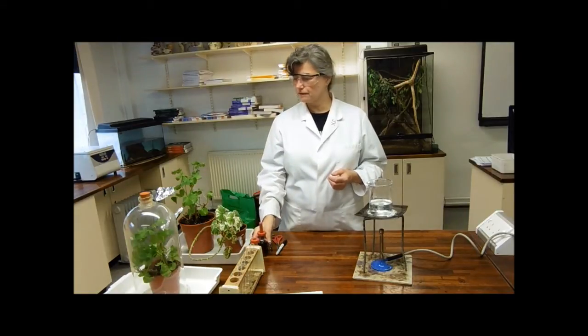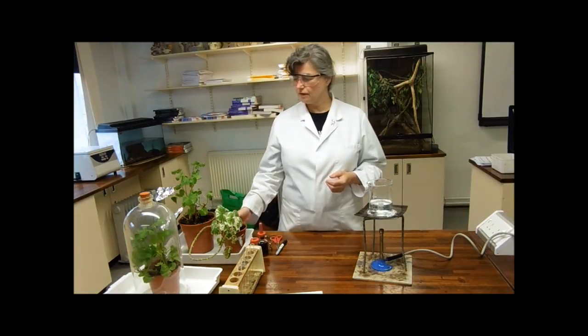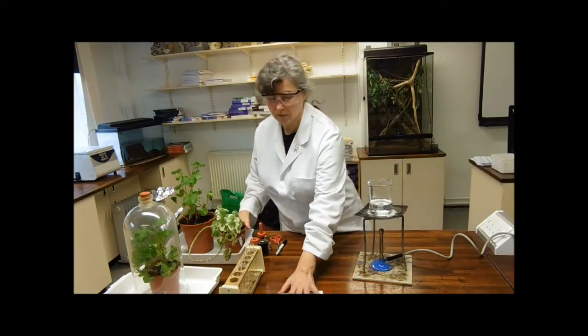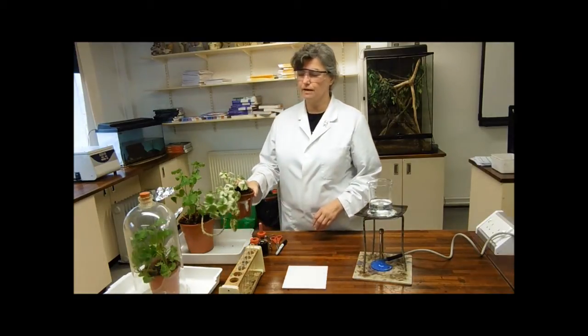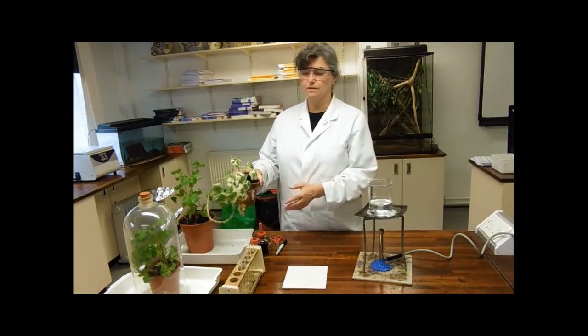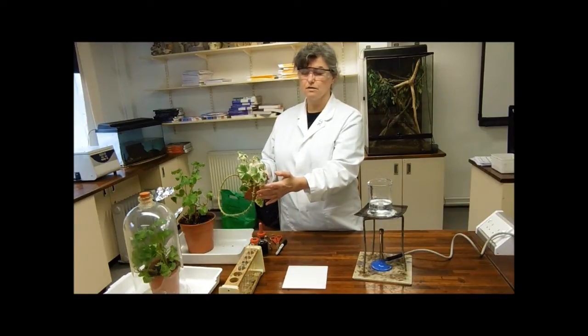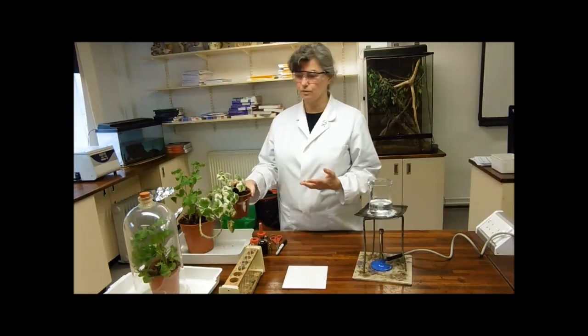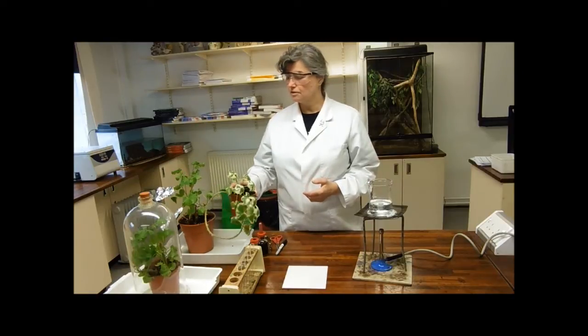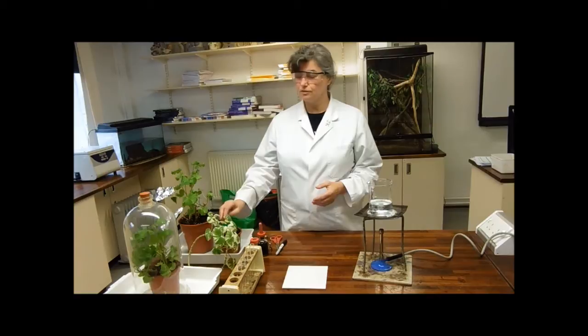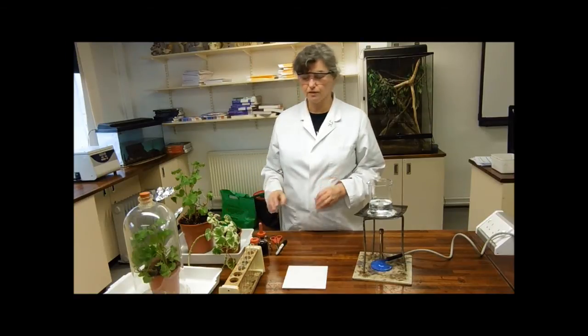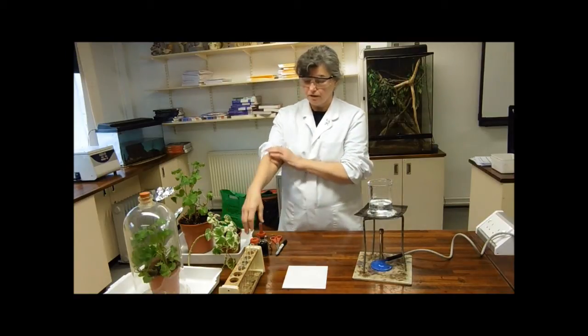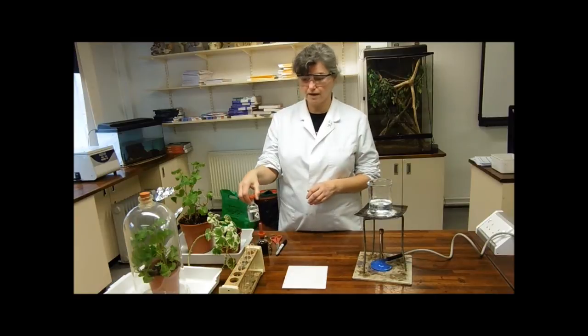However, we have a little bit of a problem, because if I just put the leaf onto my white tile and drop some iodine on it, I'm not going to be able to see very much, because the green of the chlorophyll will mask any color change. So first of all, we are going to need to remove the chlorophyll from the leaf, and for that, we're going to use ethanol.